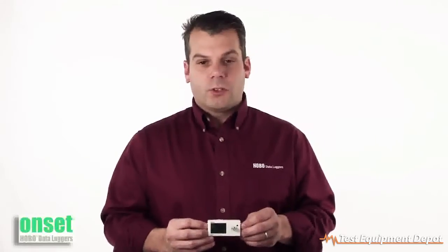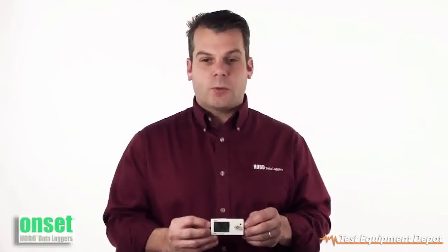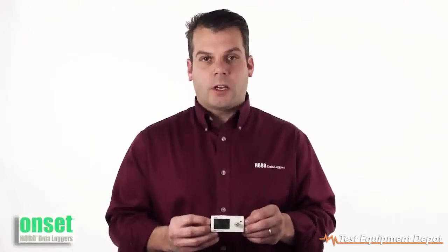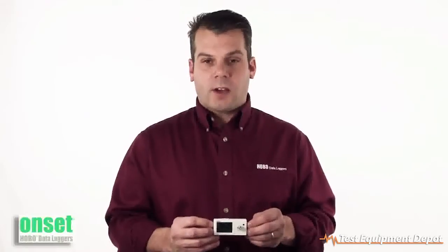There are a few new logging modes. The first is statistics, where it allows you to record the minimum, maximum, average, and standard deviation reading over your logging interval. The other is what we call burst mode — so if you go above a particular threshold, it can begin recording at a faster sampling rate.